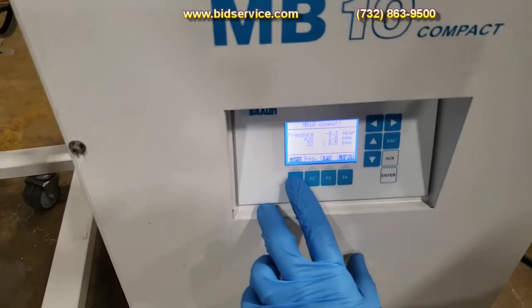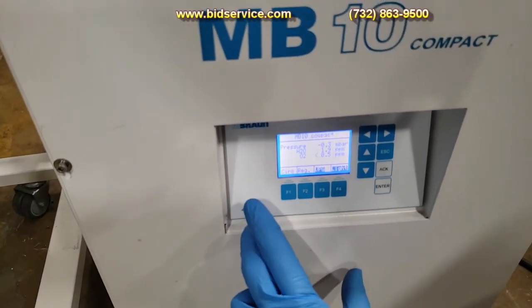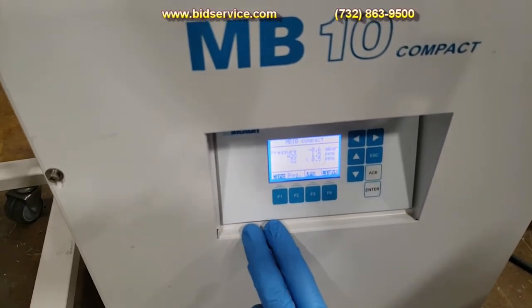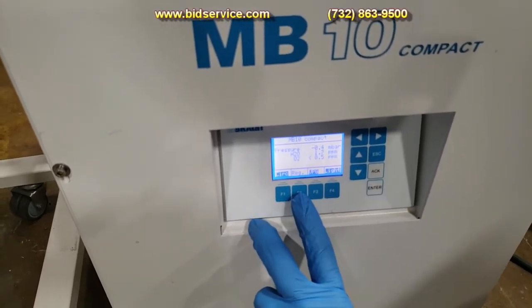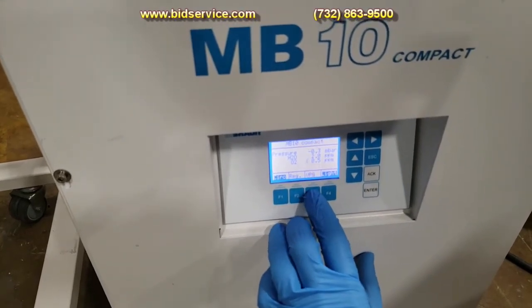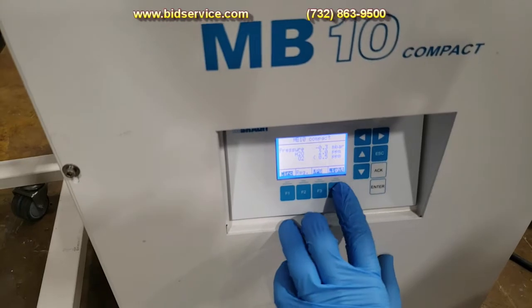A few things to point out. We have a circulator here — you can turn it on and off, you can hear that it shuts off. If you want to do a re-gen, you'll press that button. Turn your vacuum pump on and off. And then you have a switch here for light.